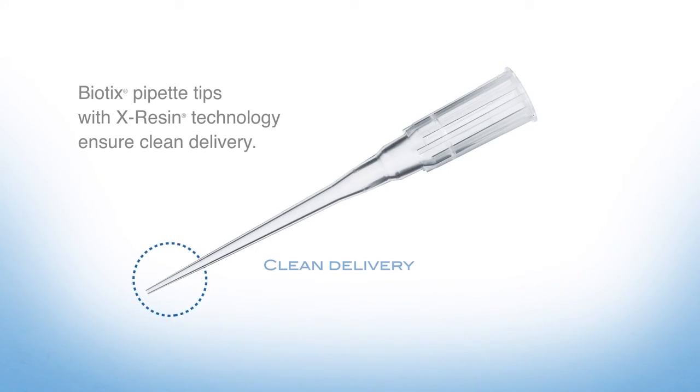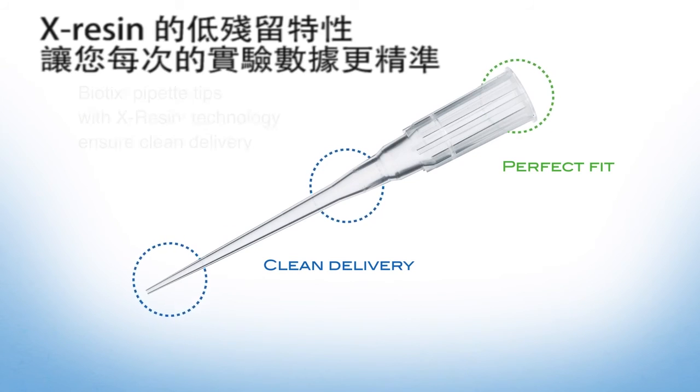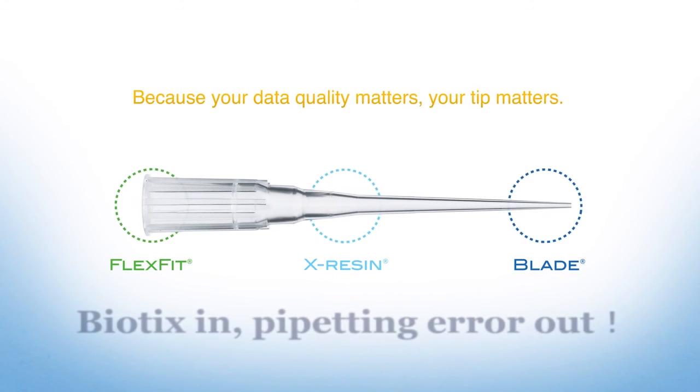Biotics pipette tips with X-Resin have low retention built-in, giving you uniform, clean delivery every time. Because your data quality matters, your tip matters. Biotics.